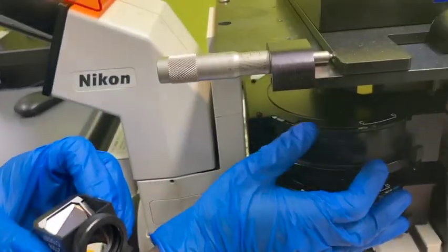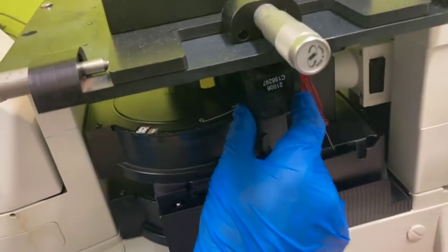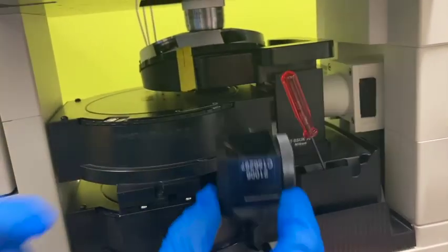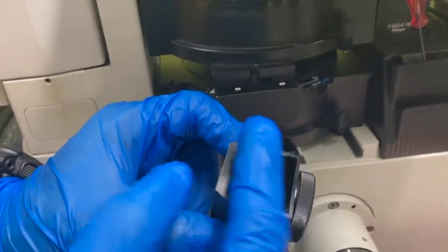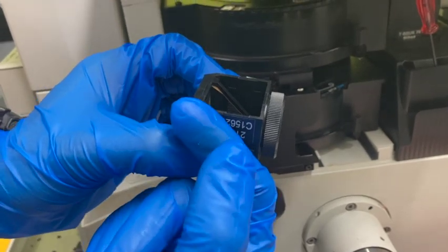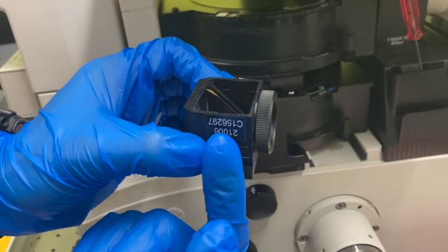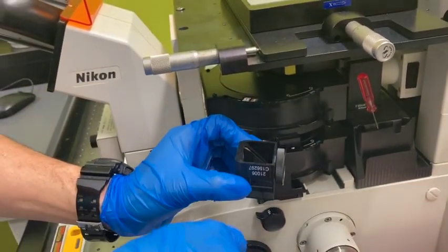When you rotate to 1, this cube will sit exactly in this position. You can see this is a mirror, with nothing up and nothing at the bottom. So just a mirror. This mirror reflects 10% and transmits 90%.